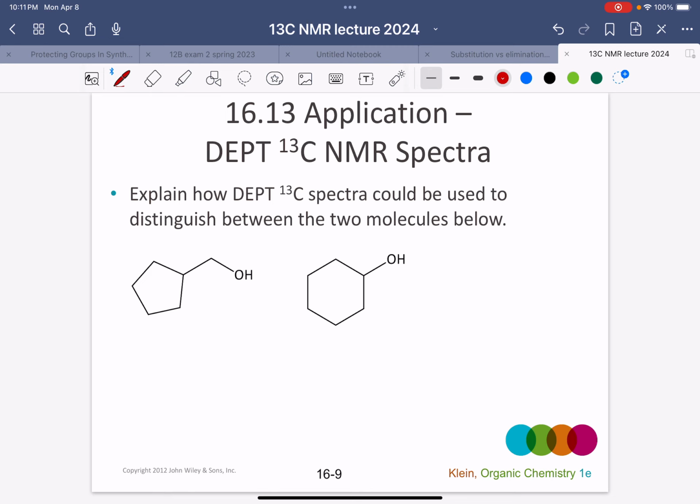and say that we could distinguish between these two isomers here. These are constitutional isomers. And here, maybe I'll highlight them in different colors. So let's go with yellow. I'll highlight my primary carbons in yellow, my CH3s. I don't have any, so I won't highlight them. I'll highlight my CH2s in yellow. Here's one, and there's one, there's one, there's one, there's one. Here I also have, there we go. And then I've got my CHs here and here.